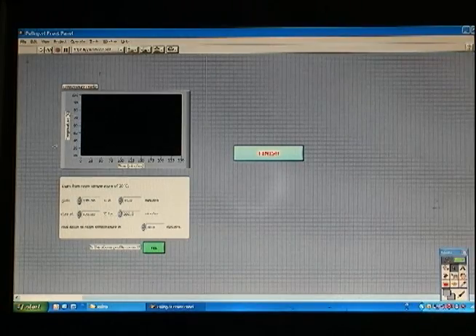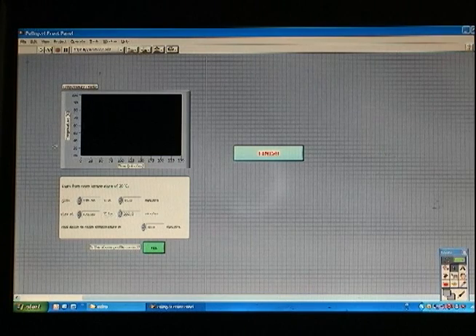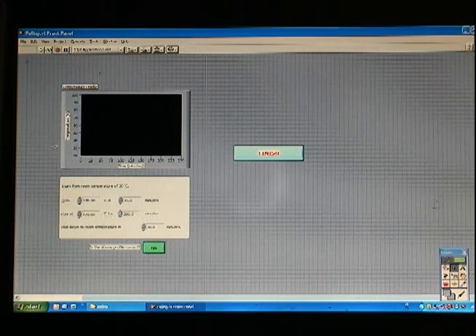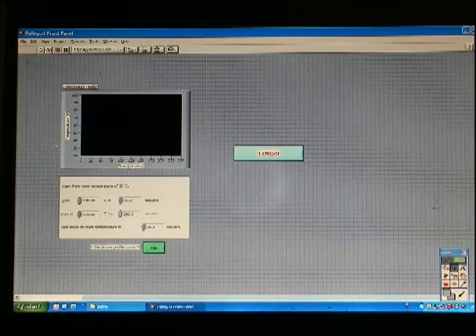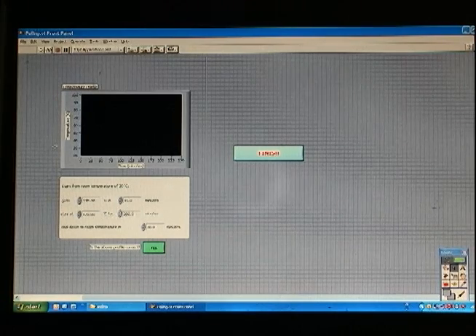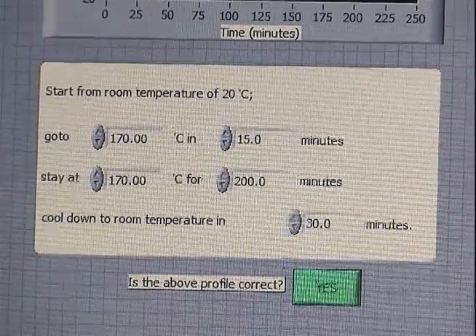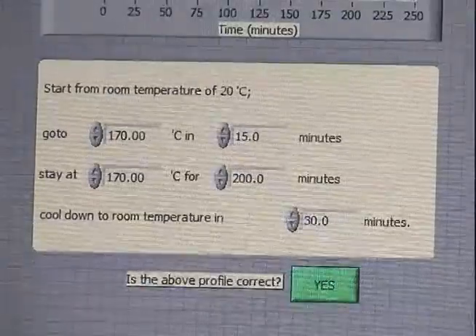After dropping the pressure, the temperature can be increased to the vapor deposition point. This is a custom LabView instrument that we use to monitor and control the temperature for the vapor deposition. You can put in the temperature you want in a particular amount of time and also say how long you'd like for it to stay at that temperature.